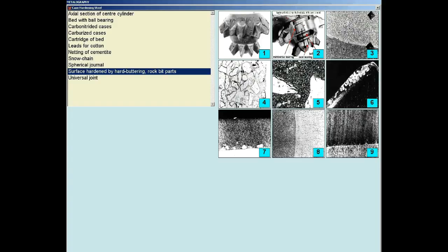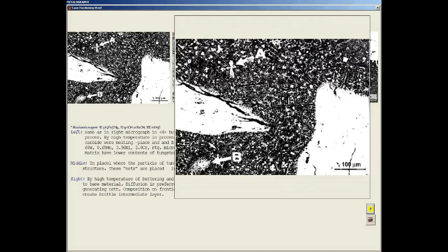As part of the carbides are rounded off, smaller carbides dissolved, and in their place a Ledeburite structure rises. It's good to see on this picture. Locally, at A and B, the last stage of melting of carbides can be seen. At the point where carbides dissolved, a Ledeburite structure arises. Along here you see the reaction between the matrix and tungsten carbide.